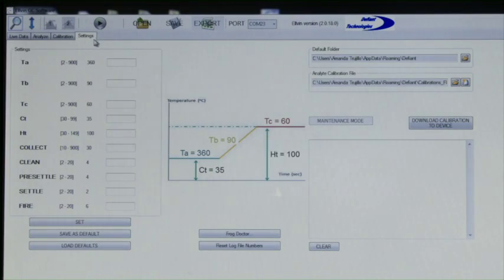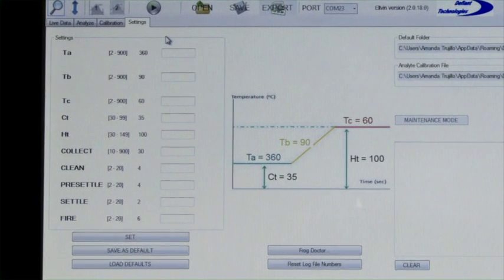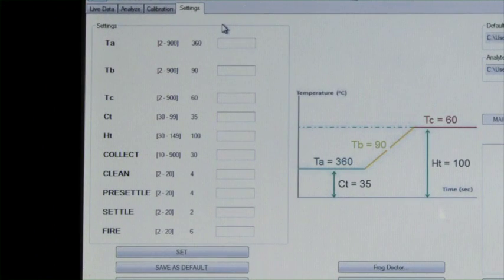The settings window shows the Frog's configuration for the GC heating profile and collection times. The same configuration that is used when calibrating the instrument must also be used when testing unknown samples in the field.